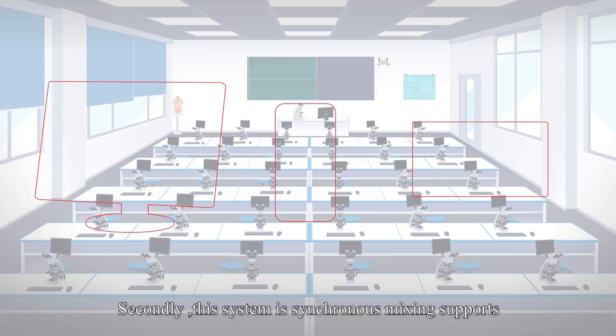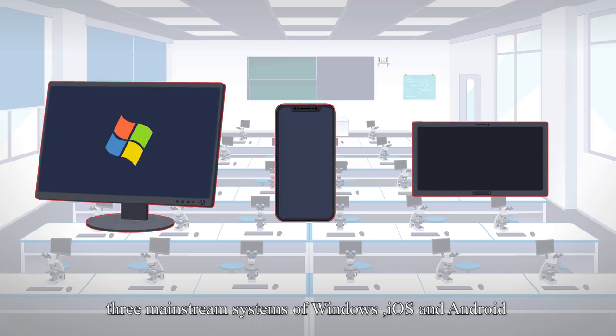Secondly, this system is synchronous, mixing supports three mainstream systems of Windows, iOS, and Android.